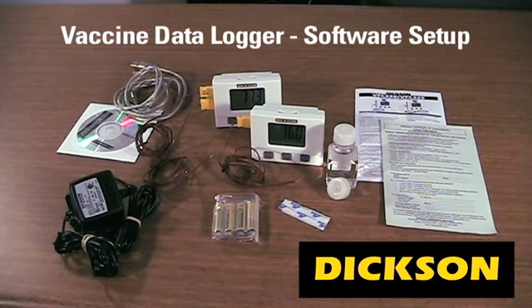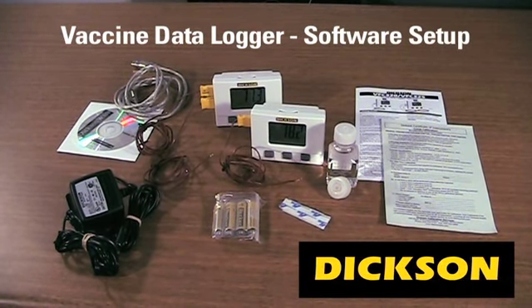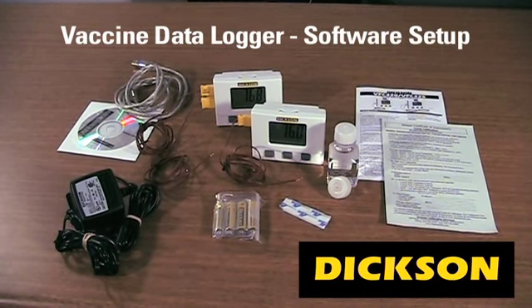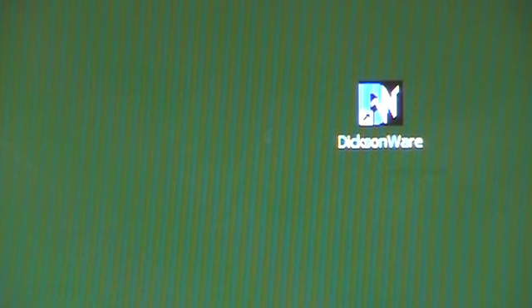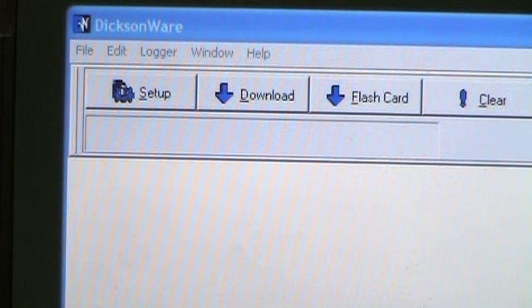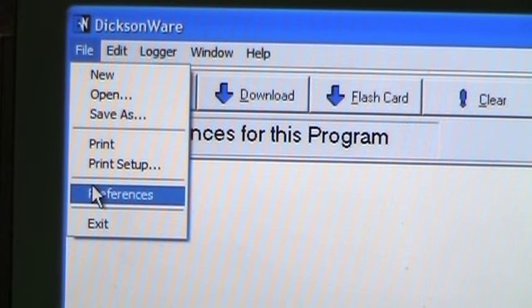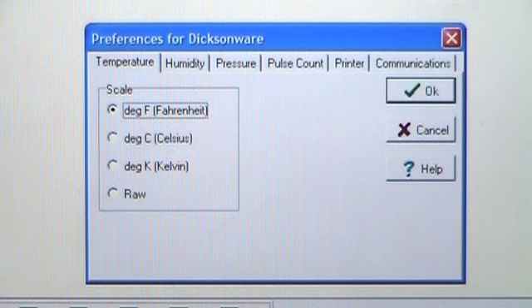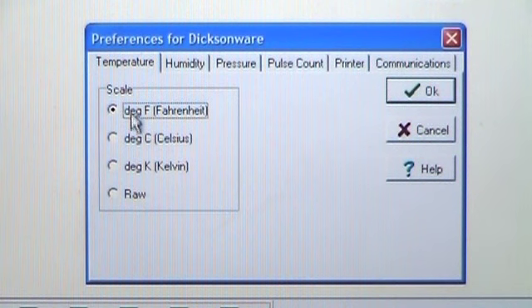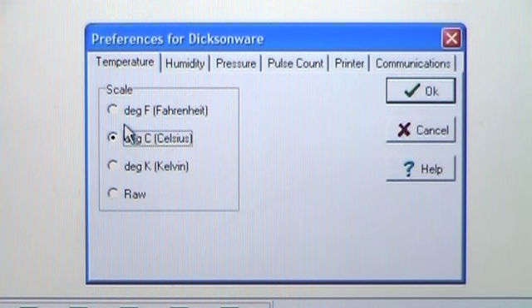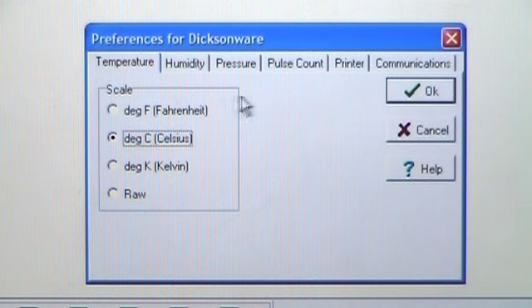We will now discuss setting up your vaccine data logger. Open Dixonware by double-clicking on the icon. To change the unit of measure for your temperature reading, choose File, then Preferences. A dialog box will appear. Click on Fahrenheit or Celsius for your preference and temperature readings on the downloaded data, then choose OK.